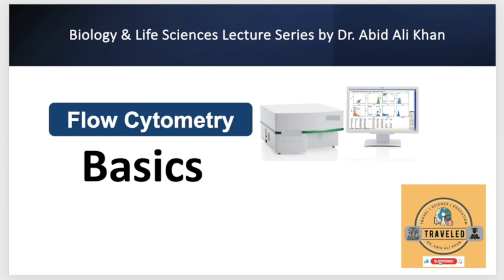So without any further delay, we are going to start today's lecture about flow cytometry. This is going to be one of the first lectures about flow cytometry that we are going to talk about in the next few days, starting with the basics. So today's lecture will be focused just on the basics. Let's start and discuss what flow cytometry is.